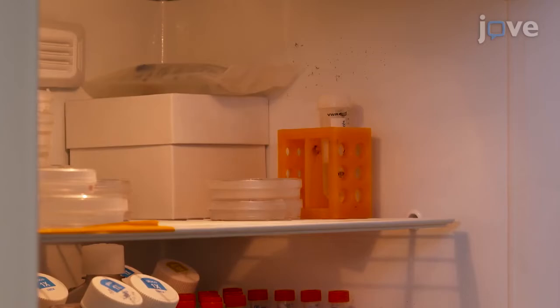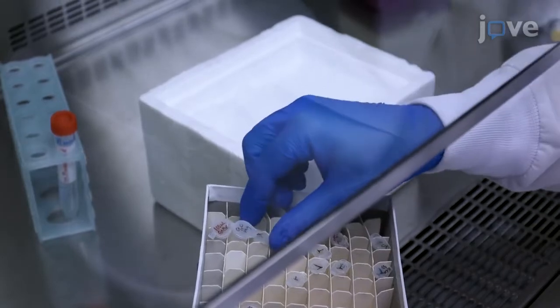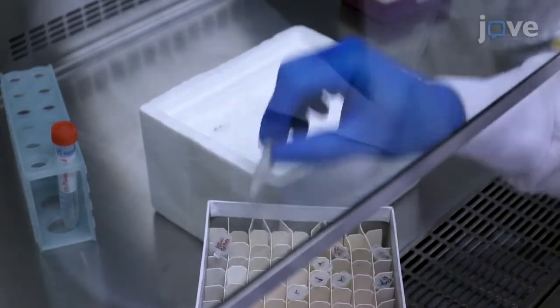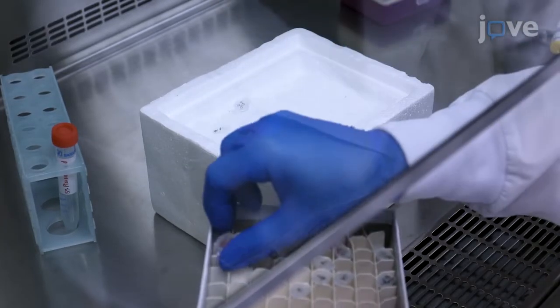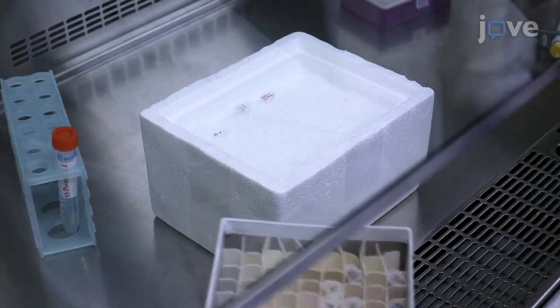Store the culture dish at 4 degrees Celsius until the cells are ready for seeding. Then, slowly thaw one 50 microliter aliquot of basement membrane extract and one 10 microliter aliquot of thrombin on ice in the culture hood.